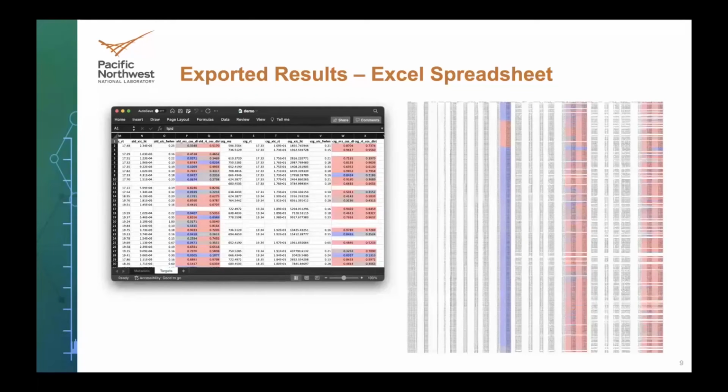If you were to zoom way out and squint at this whole table, we have our precursor information, then aldehyde and Criegee. And you'd look for lines that have high scores, so this blue color coding across the board, where the precursor looks good and the pair of fragments looks good.